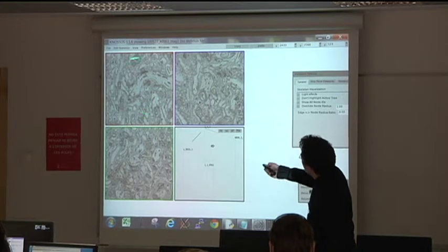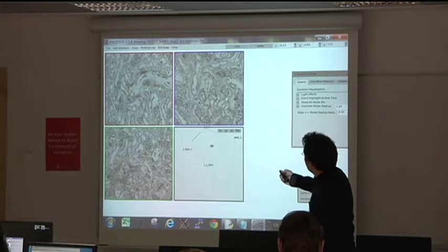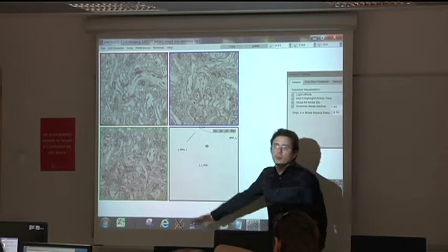So this is the XY viewport. That is the viewport, the plane in which the data was taken. And these are the orthogonal reslices. So this is the entire data cube. The images were taken with the EM from the top of the block, but then assembled, right?